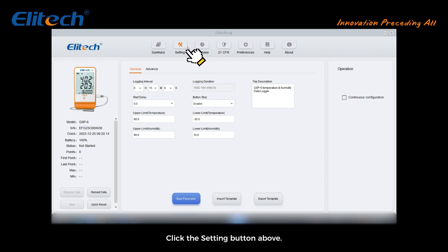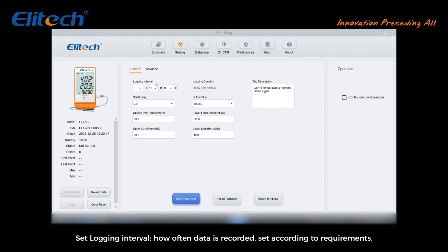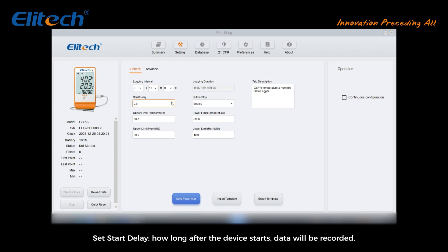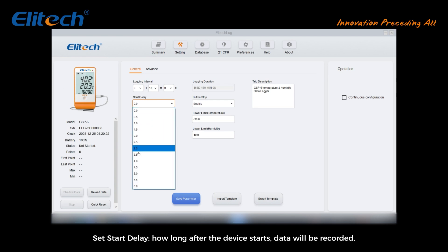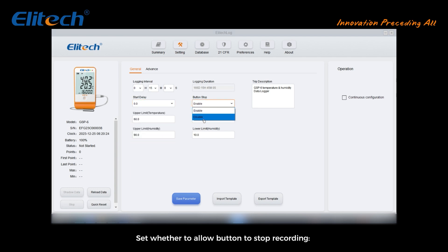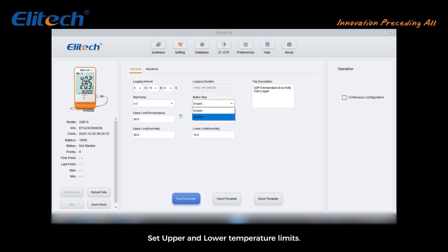Click the settings button above to enter the parameter setting page. Set the logging interval — how often data is recorded. Set start delay — how long after the device starts before data will be recorded. Set whether to allow the button to stop recording — press and hold the device button to pause recording.